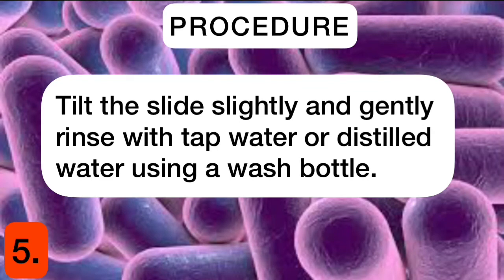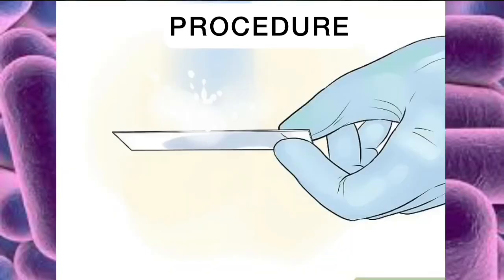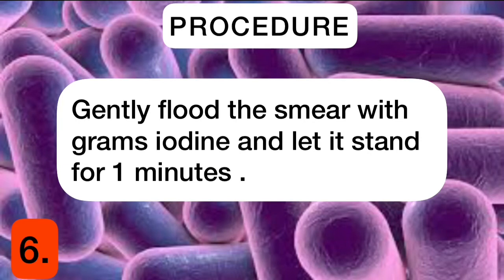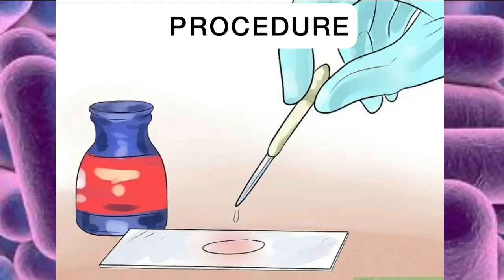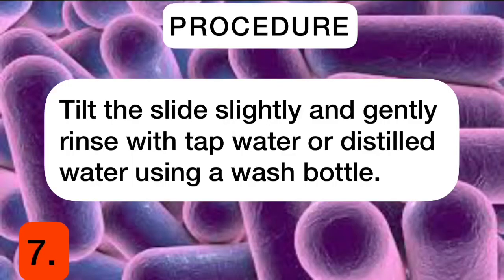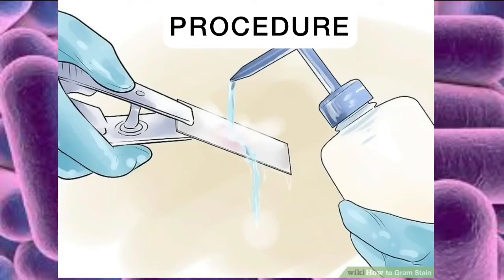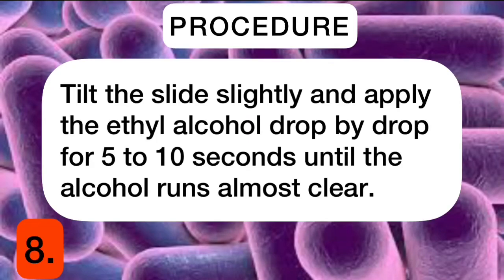Tilt the slide slightly and gently rinse with tap water or distilled water using a wash bottle. Gently flood the smear with Gram's iodine and let it stand for one minute. Tilt the slide slightly and gently rinse again with tap water or distilled water. Then tilt the slide slightly and apply the ethyl alcohol drop by drop for five to ten seconds until the alcohol runs almost clear.